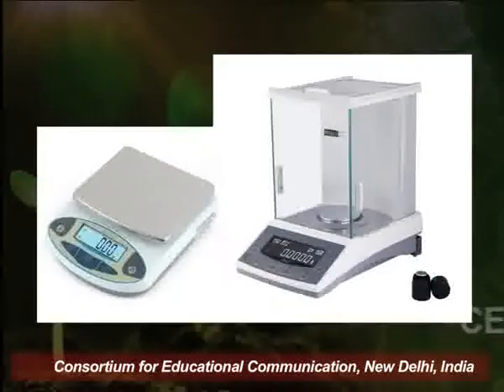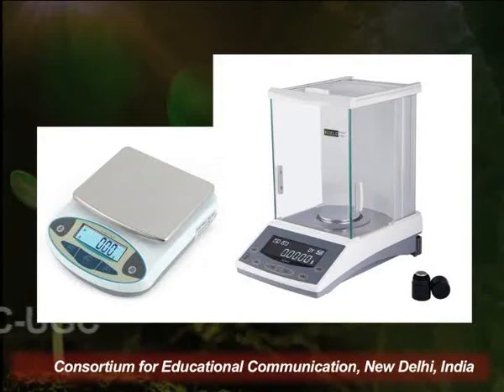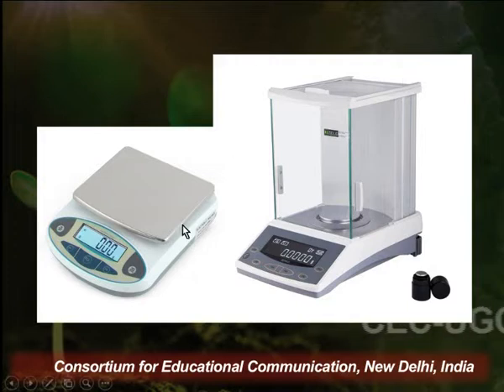These are some pictures and diagrams of common laboratory weighing machines. Here on the left hand side, this is a top loading weighing balance and this is an analytical balance. Basically both of them are analytical balances only.